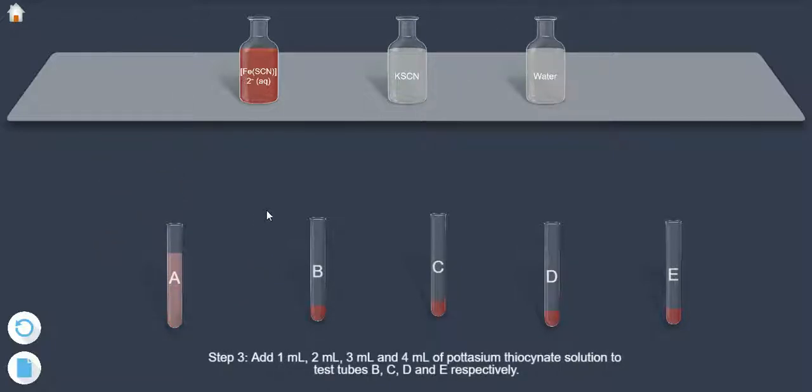Step 3. Add 1 ml, 2 ml, 3 ml and 4 ml of potassium thiocyanate solution to test tubes B, C, D and E respectively.